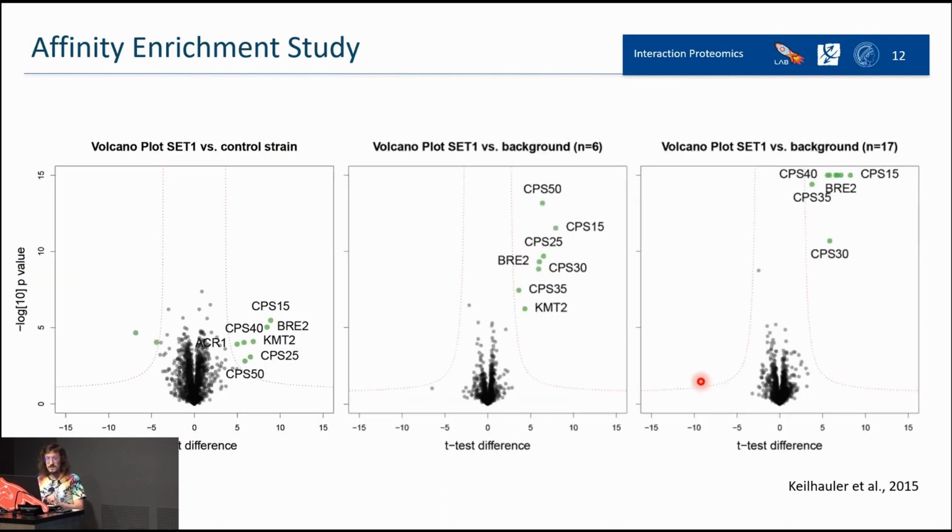another interesting thing they did, to reduce the kind of error and also to get more significant data, was, instead of doing the log fold change between the situation with the bait and the controls, they just decided to use as a control the entire amount of protein that was sequenced in every single situation.